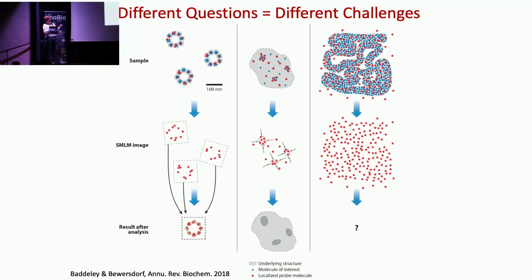Another question might be that you look at some membrane patch or a synapse, and you want to see clustering of particular proteins. Do they cluster? How big are these clusters? How many copies of that molecule are in the cluster? And here you face challenges, like, for example, to even identify what is a cluster. Everything just is clouds of localization. So what makes this a cluster? Well, let me exclude these other individual localizations here, right? Or should that cluster actually include this localization here as well? So you need to work on implementing clustering algorithms to get reliable data here.